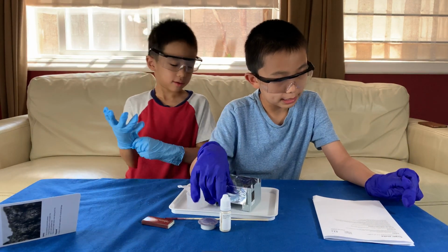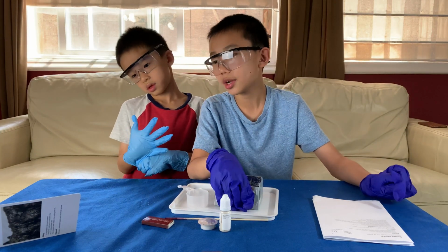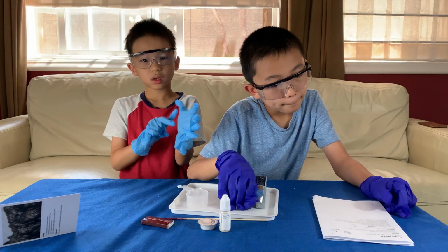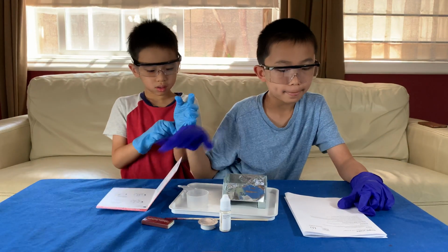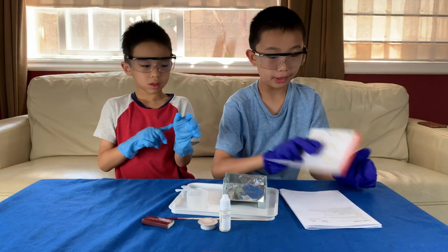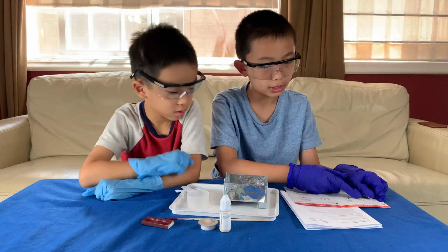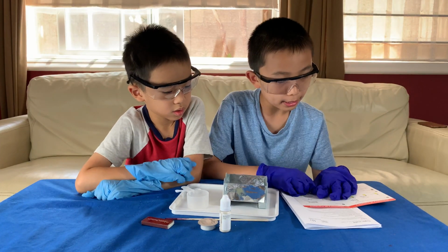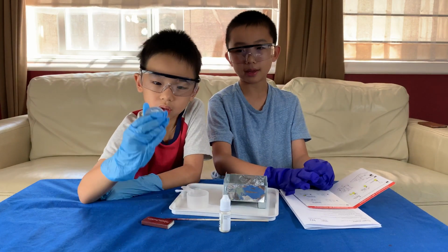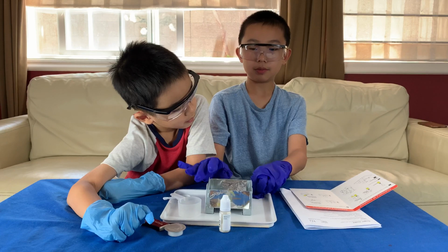Cover the open sides of the stove with the pieces of foil as shown in the instructions. Okay, like this. Here, take that book with you. So, no, so you're looking at both. Okay. Cover the open sides of the stove with the pieces of foil as shown in the instructions. We did that. And now take a tablet of solid fuel from the blister pack. Here. Okay, and then you're gonna put it in here.